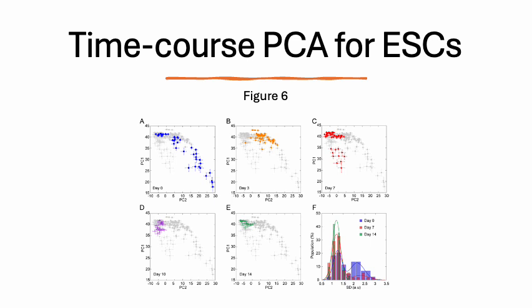And this really shows how powerful Raman spectroscopy could be for continuously and non-invasively tracking how single cells or a group of cells moves from a pluripotent state into a more specialized one. And for stem cell biology and regenerative medicine, this kind of single cell insight could be incredibly valuable, especially when it comes down to improving culture conditions or ensuring that differentiated cells are consistent and reliable enough for clinical use.